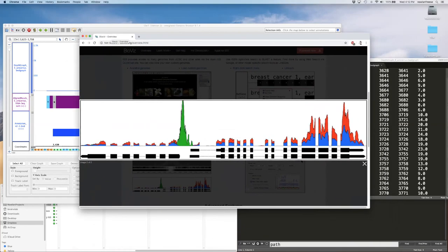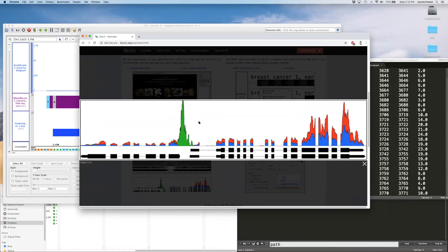Here's an example on the IGB website: the blue is the control and the red is the experimental, and the green is ChIP-seq data overlaid. You can see the ChIP-seq affecting this gene and the difference in expression between the control and the experimental — an example of what you might see in a publication.